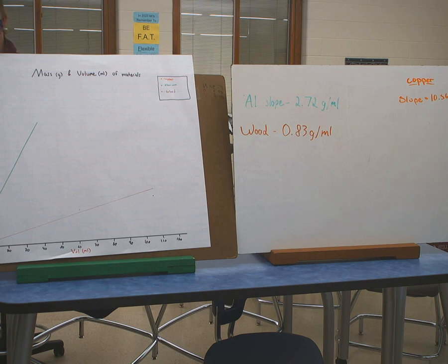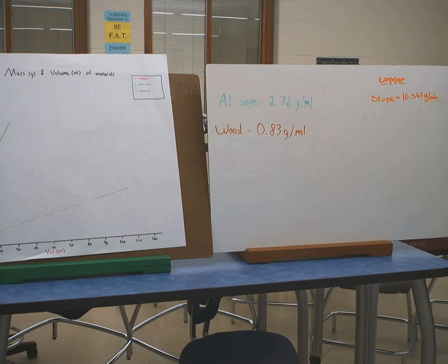That's perfect, right? Good. Now, this is true for any piece of aluminum. We have the same density because it's a comparison of the two ratios, grams and milliliters. Now, I know what the aluminum's supposed to be, 2.70, exactly 2.7, and we're really close. And I know copper's supposed to be 8.9 grams per milliliter. I just happen to know those densities because I looked them up yesterday. How come we're close but not exactly on?